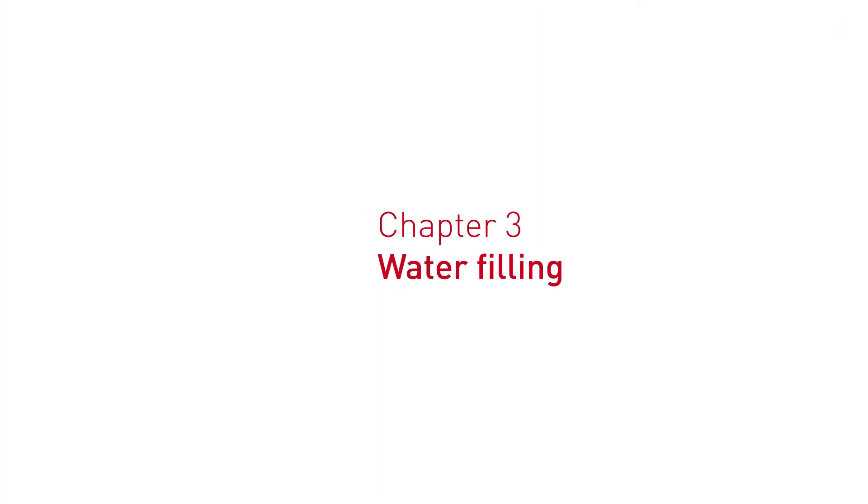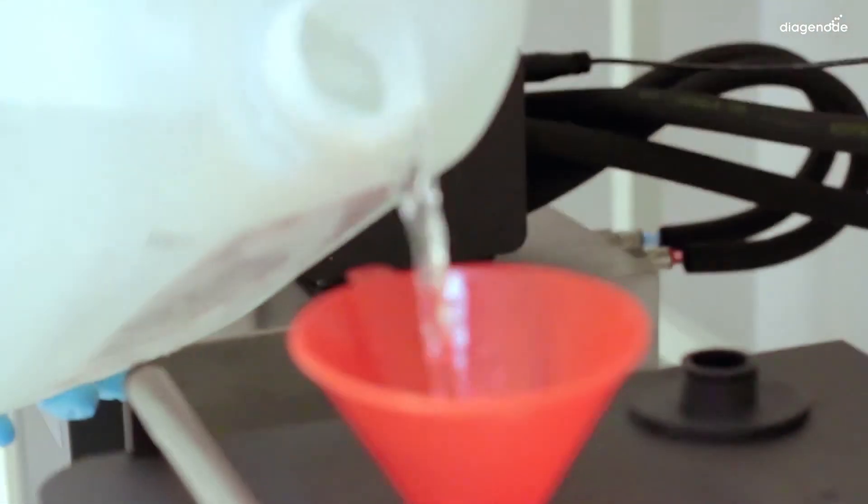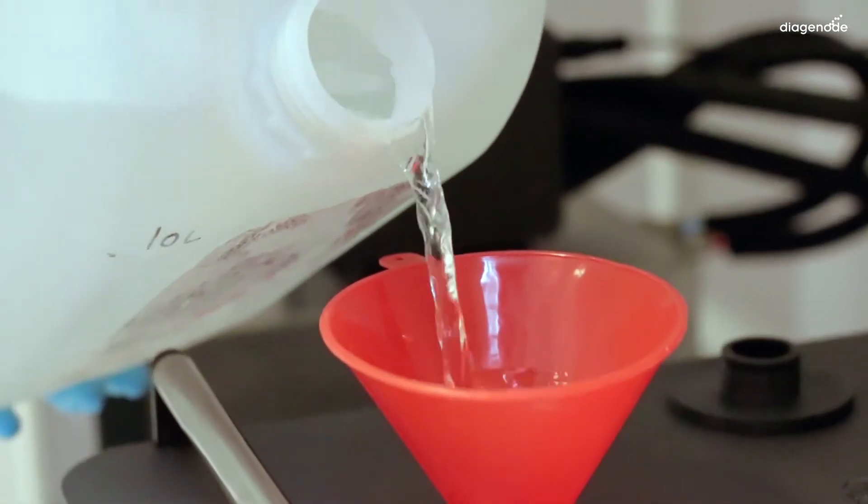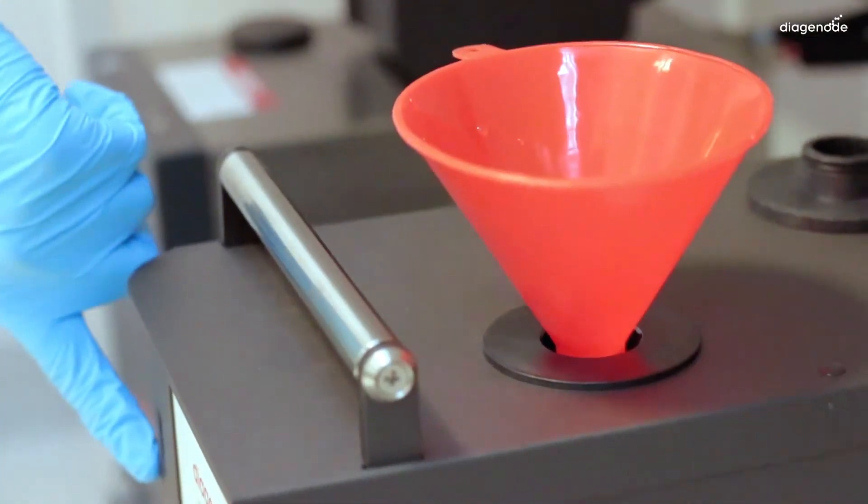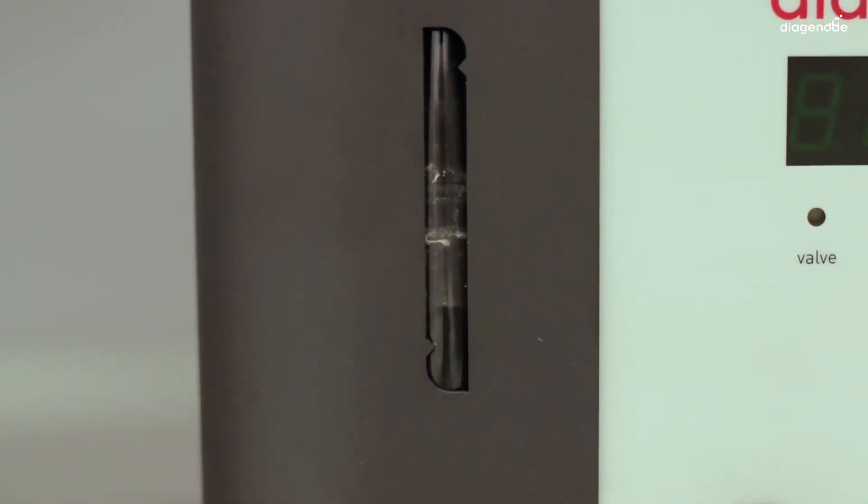Now fill the tank of the cooler with about two or three liters of distilled water. In fact, you just have to observe the water level. When the level is between minimum and maximum, stop filling.